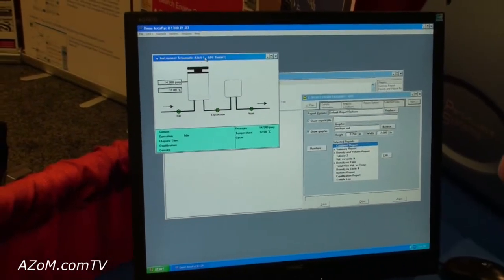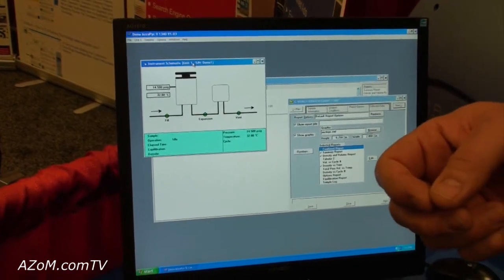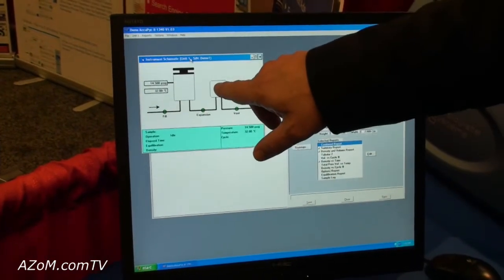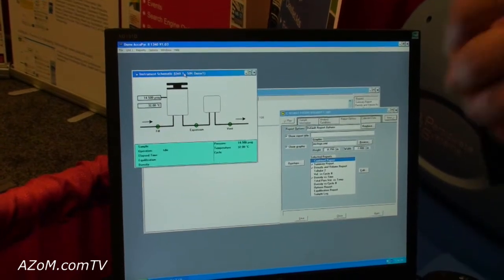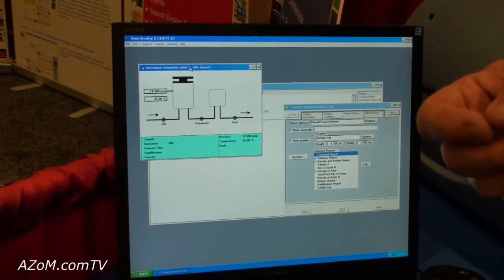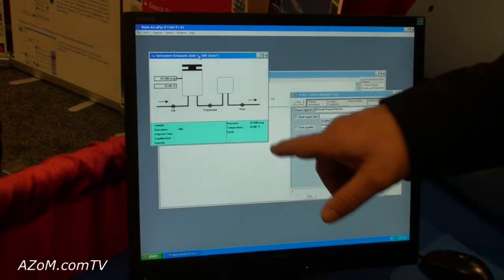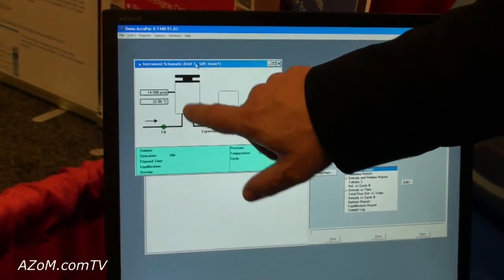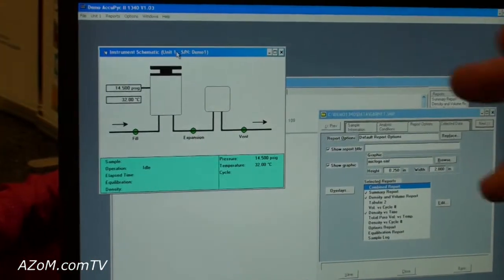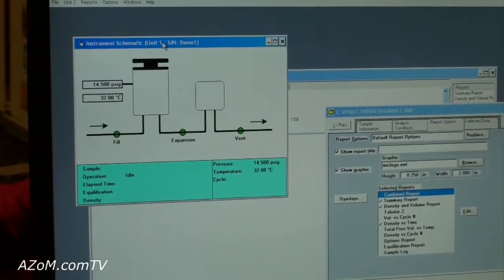We're able to do this because we have calibrated the sample chamber and the expansion chamber with NIST traceable calibration spheres. Once those known spheres are entered and analyzed, the microprocessor records the sample chamber and expansion chamber and stores those for future unknown sample measurements.